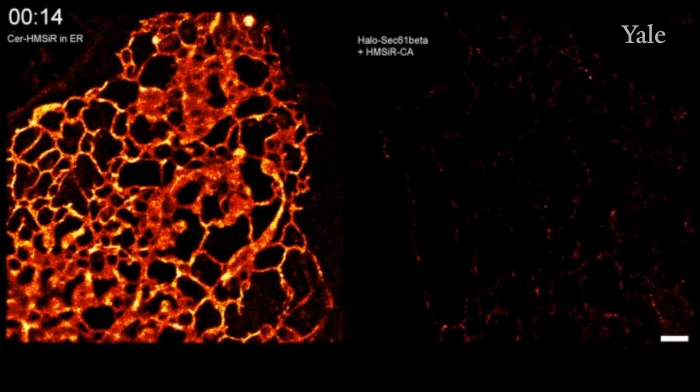Linking the dye to the lipid does two things simultaneously. First, it keeps the dye in a state in which it doesn't absorb light, and second, it increases the labeling density by about 2 orders of magnitude. And by combining those two properties, we're able to visualize movies for 50 times longer than what was possible previously.